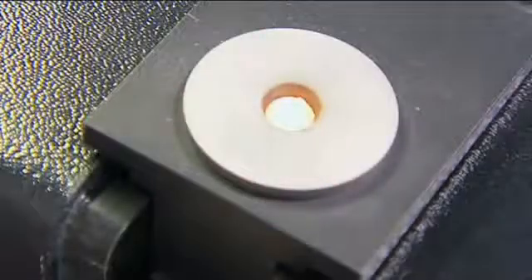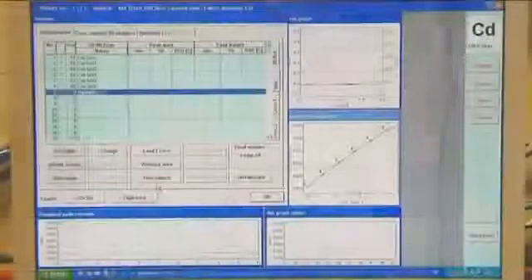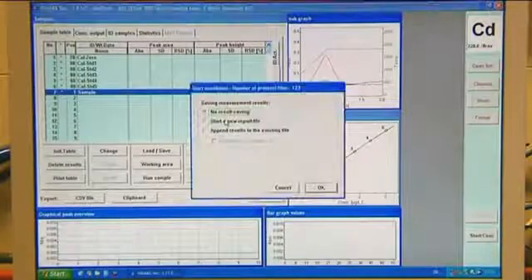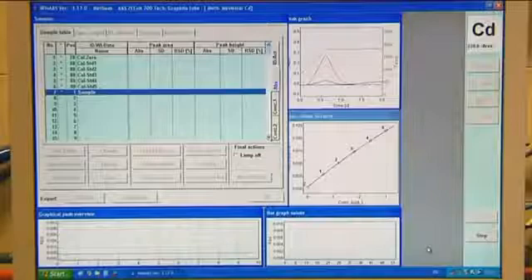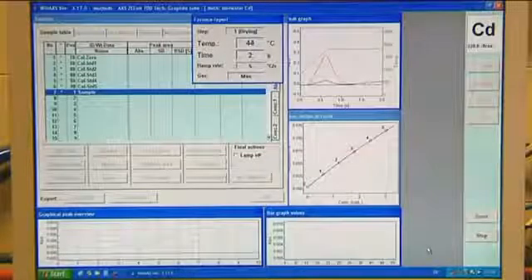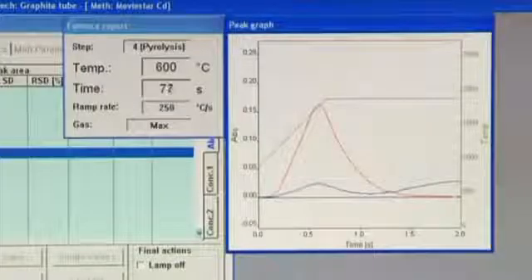The patented third generation Zeeman effect background correction works with a variable magnetic field and offers sensitive background correction with a doubled timing pulse frequency. By using a three-field technique, the sensitivity of the graphite furnace system can, if required, be reduced and adapted to the desired concentration range, allowing higher concentrations to also be measured in the graphite furnace. The coupling of the two techniques opens up a calibration range over three decades which could not be realized previously.